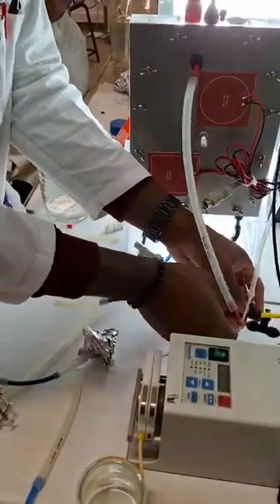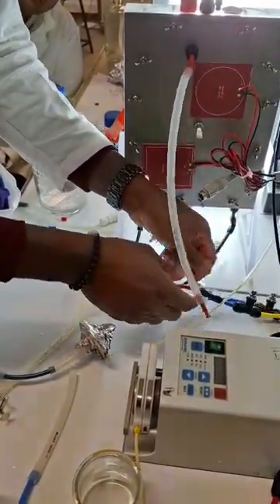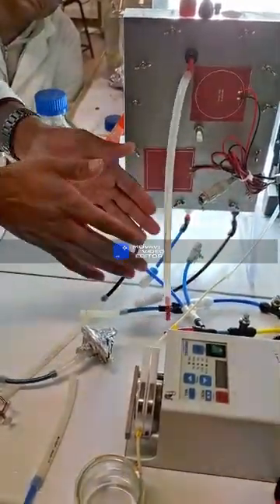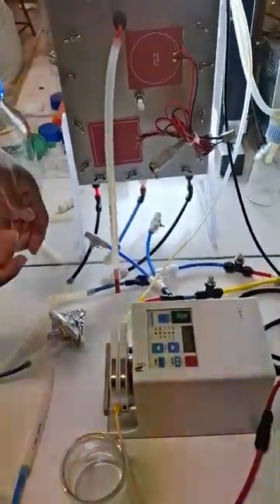We don't supply carbon dioxide inside the photobioreactor now. It's both. In this case, it will be both, but it's not a problem because the flow for the carbon dioxide will be divided by 3, but it will be the same amount.